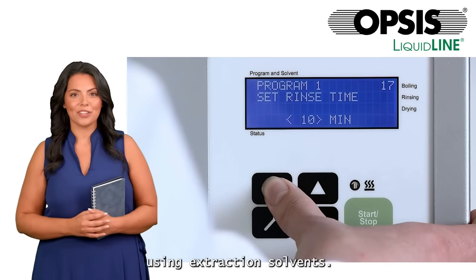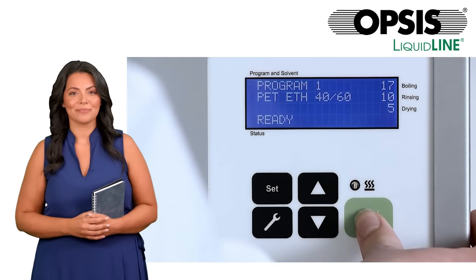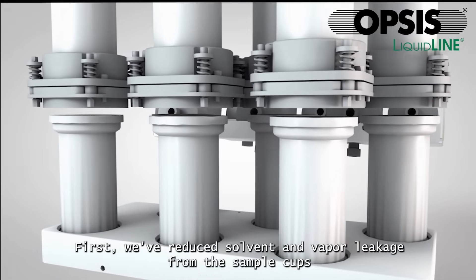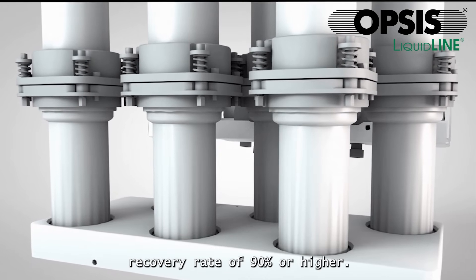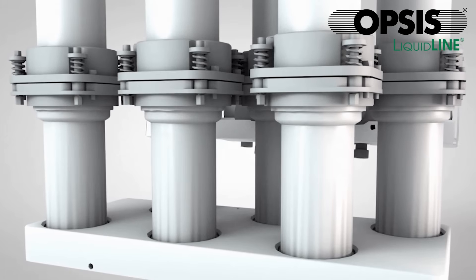The SOXROC is carefully engineered to minimize risks associated with using extraction solvents. First, we've reduced solvent and vapor leakage from the sample cups by developing a unique locking mechanism that applies nearly 200 kilograms of pressure between the cups and condensers, achieving a solvent recovery rate of 90% or higher.